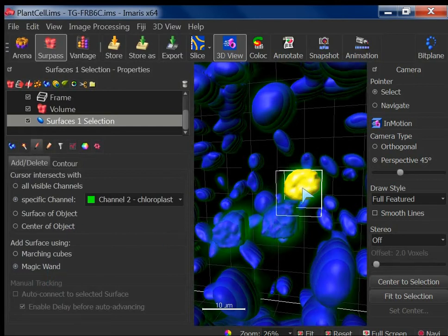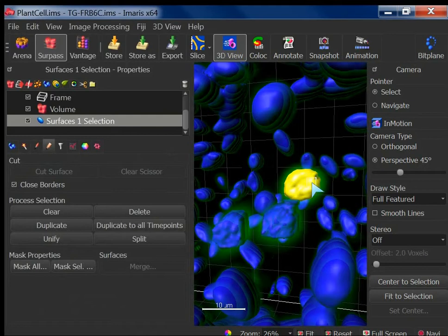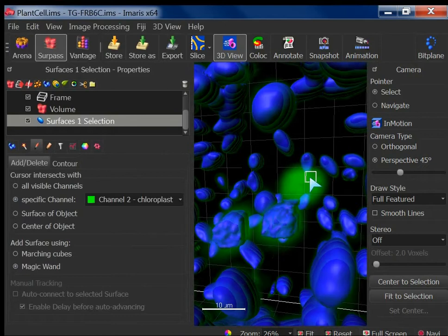So now because we are confined to this particular location, right? But now, again, there is a compromise, because if you make it bigger and bigger, it might touch the boundary of the other object. So it's a compromise. It's a user choice, right? There is no threshold as such, because it is driven by the visual feedback, right? So, but let's try that. So let's say I delete this, I come back here, and I try to increase. Let's see. Say shift.